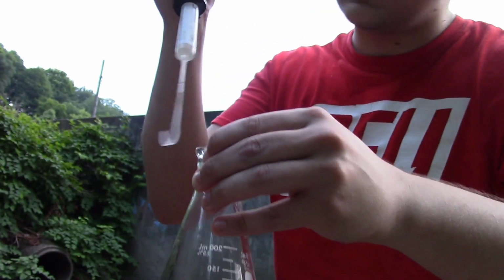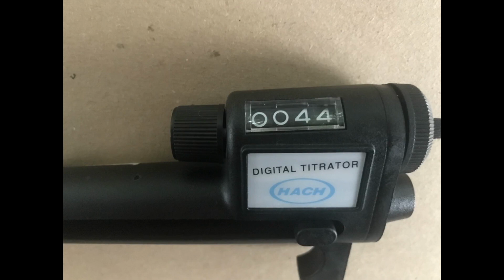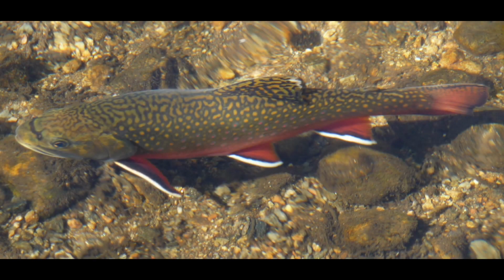So let's see what the reading is on here. 44. An alkalinity of 44 milligrams per liter as calcium carbonate shows that the stream is healthy. This means that the stream has a strong resistance to pH change from acid rain. Stream water above 20 milligrams per liter as calcium carbonate makes a great home for fish like trout.